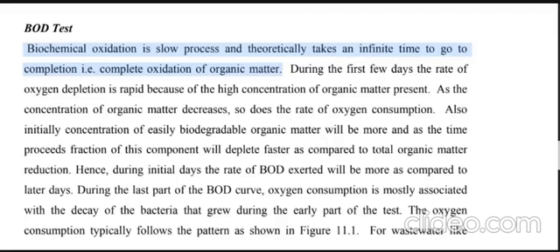And that is the big reason why the maximum depletion takes place during the first few days. Also, it depends on the biodegradable organic matter. What type of biodegradable organic matter is present? What is the initial concentration of the biodegradable organic matter? This is also important, because I want to give you one example.